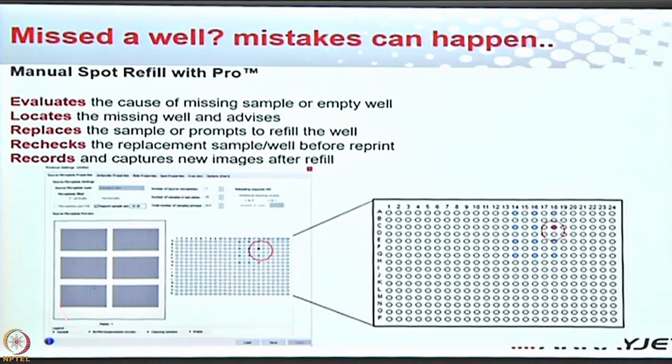So this is your plate map. This is what I showed you. This is your plate. Now remember, you've forgotten to fill this well, and that's okay. When you're doing the manual method, it'll go back to your print run, your print design, and it'll show you this is the place where your sample is missing. So you can take the plate and have a look: yes, it's missing, I've genuinely forgotten, which is fine. You put a buffer in, or you say, okay, it's not too late, I can put a sample in again. So you go to your lab, quickly prepare a sample, put it back in, put the plate inside the reader, and it starts where it left off.